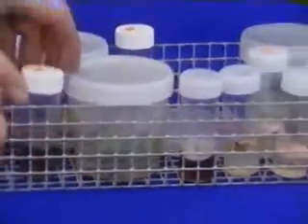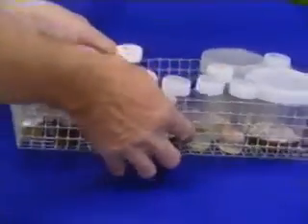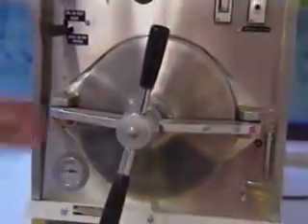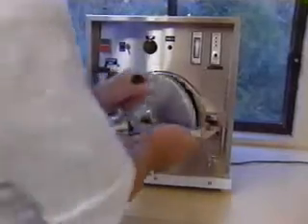When these contaminants can be identified visually, cultures containing them are quickly discarded. Contaminated culture vessels should be sterilized in the autoclave without removing the cover to avoid contaminating the laboratory. Some bacterial contaminants, such as Bacillus, Erwinia, or Pseudomonas, sometimes remain inside the plantlets without being detected until late in the culture period. These are the cause of what we call the latent infestation.